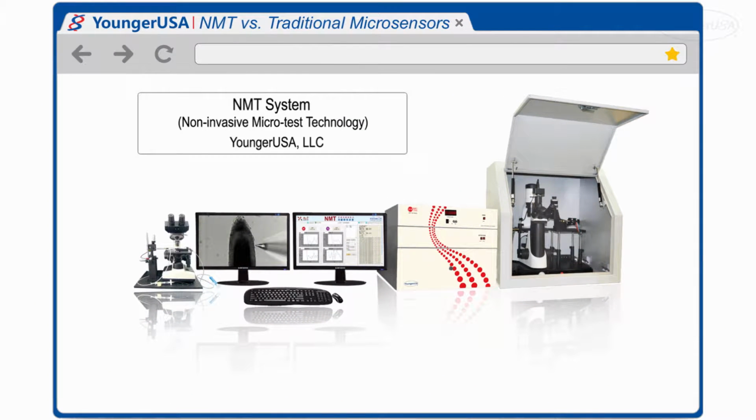This here is the NMT system produced by YoungerUSA. It is made up of three main components: the signal acquisition system, the motion control system, and the data analysis system. Since NMT is a very sensitive system and can pick up signals from electronics such as cell phones and televisions, the Faraday cage is needed to block out all of this electronic noise, which could result in false readings.